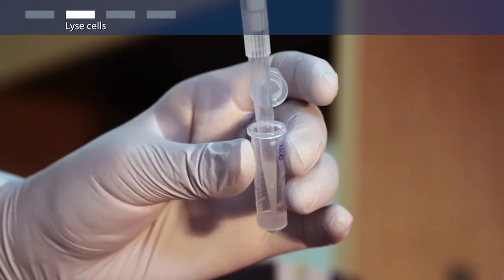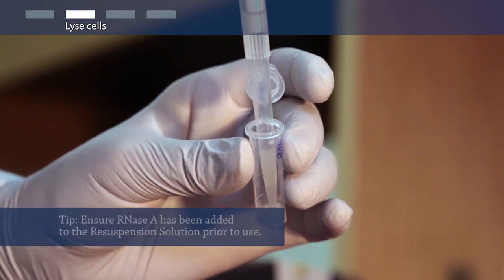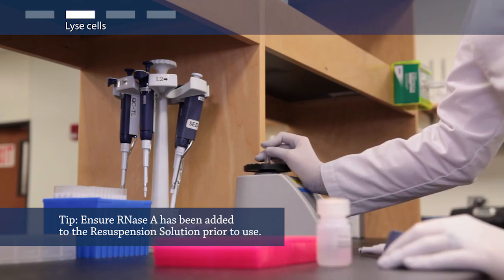First, resuspend your pelleted bacterial cells in 250 microliters of resuspension solution. Vortex or pipette to mix thoroughly.